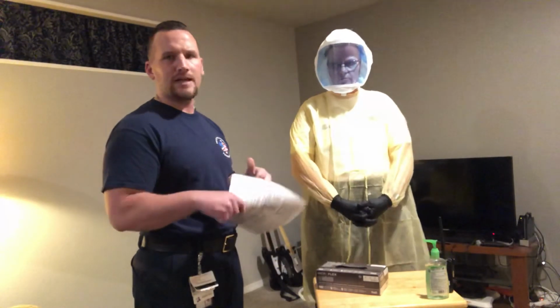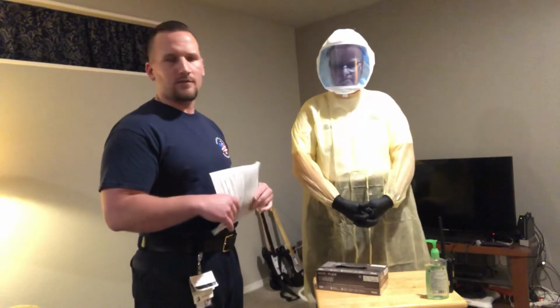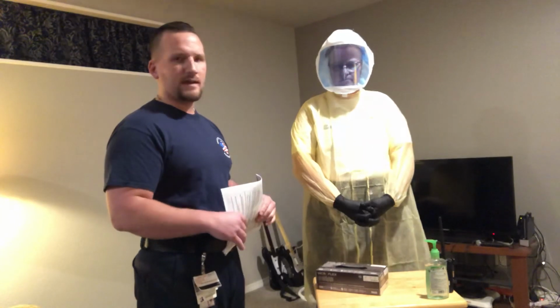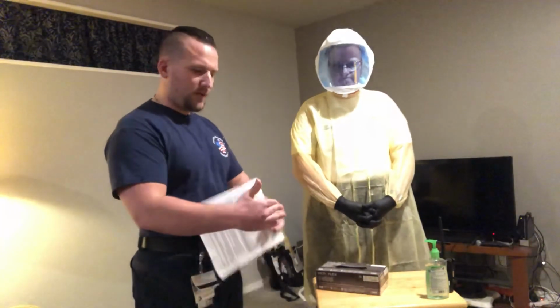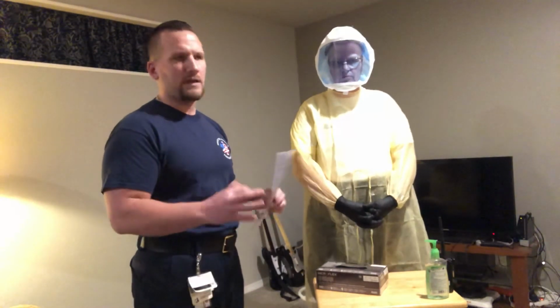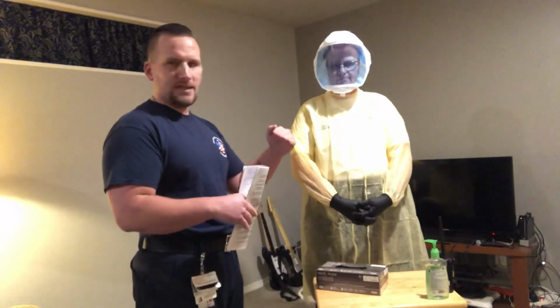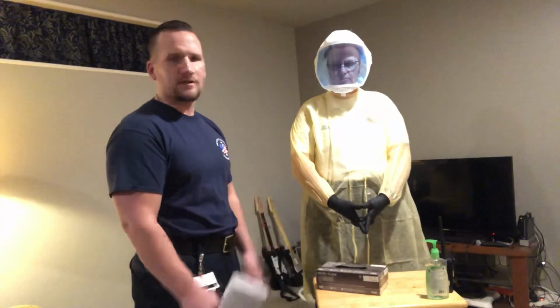Anyway, if something's wrong, if it's not filtering, if the motor's going down, if the battery's dying, it will yell at you. There's a couple display lights on the back. Green lights are basically going to tell you, just a very abbreviated version, that you're running just fine, okay? There's a green bar that will fill with 4 green lights when you're up to optimal flow, and there are different flow settings you can use if you need to. For the most part, don't worry about that. Just turn it on, let it do its thing. It'll flow what it needs to. But when that's flowing appropriately, that bar will be completely lit up green. If it's not, it'll be diminished. It can turn red, which means basically we're having massive problems. It's either not filtering or we're just not getting any flow and there's a problem with the motor.